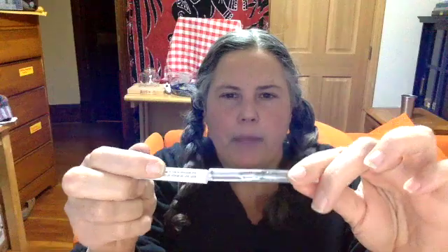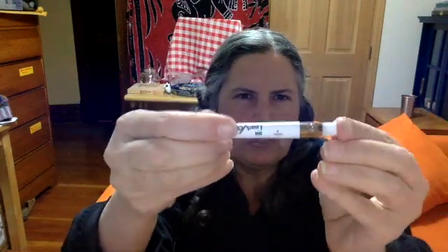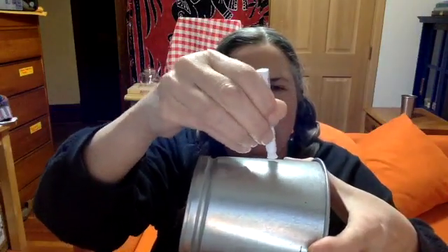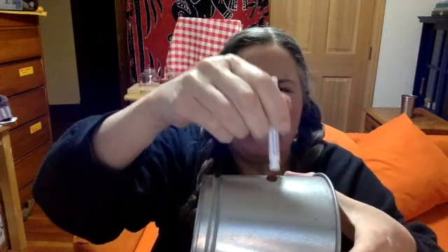I'm going to use another lead check swab here to test this pot from Ikea. We've got liquid and powder and we're going to crush, crush, and shake. The inside is yellowish and I'm going to drop the liquid onto the item I'm testing. I'm going to rub a bit — whoops, it's round so it's dripping everywhere. This is a zinc item that tested negative using XRF technology, and it's also testing negative using a lead check swab.